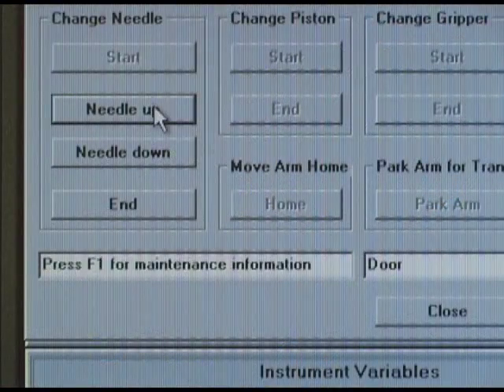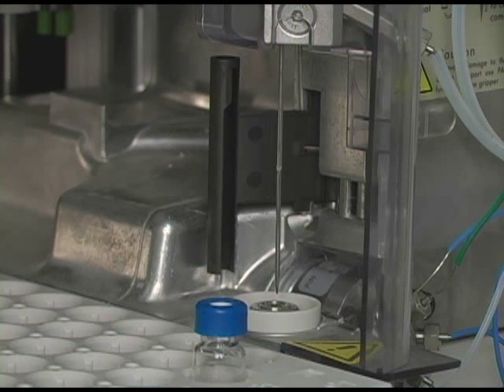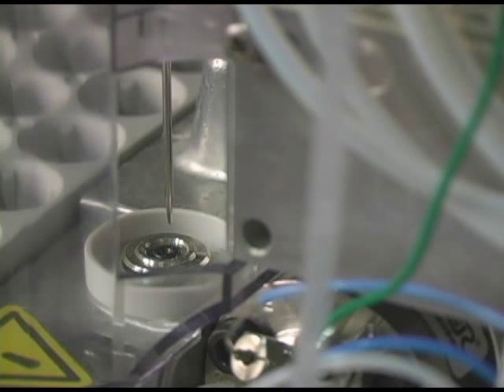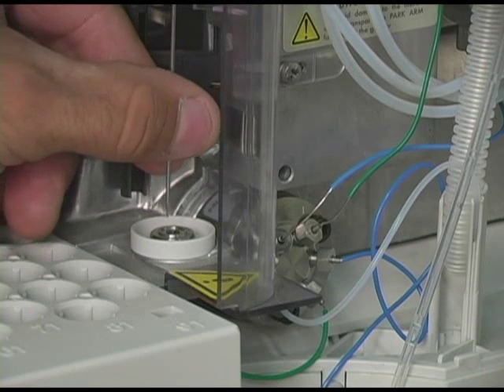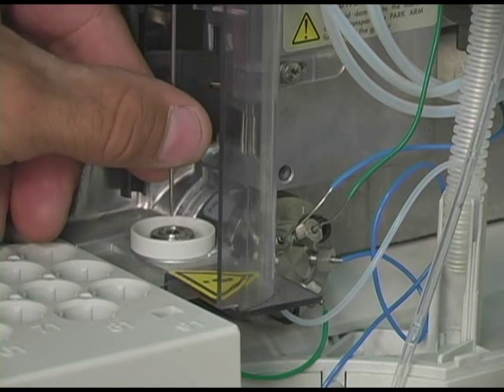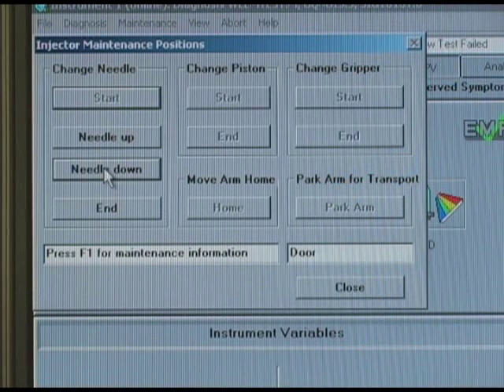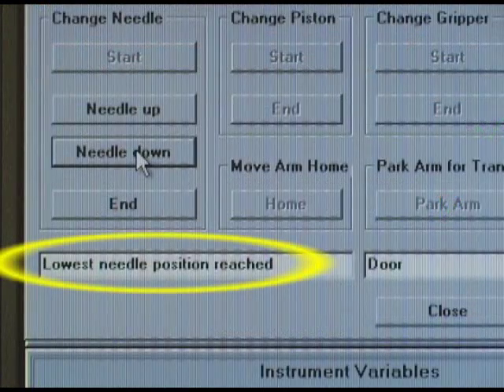Going back to ChemStation, click on the Needle Up button repeatedly, until the Needle is approximately 2mm above the Needle Seat. You'll need to make sure that the Needle is properly aligned with the center of the Needle Seat. If required, bend the Needle slightly until proper alignment is achieved. Once you have the Needle aligned, go back to ChemStation and repeatedly press the Needle Down button until the Needle reaches its lowest position.